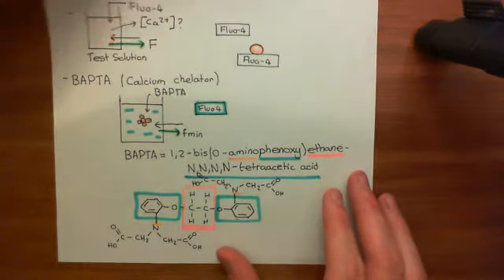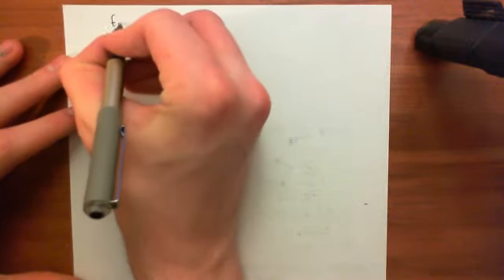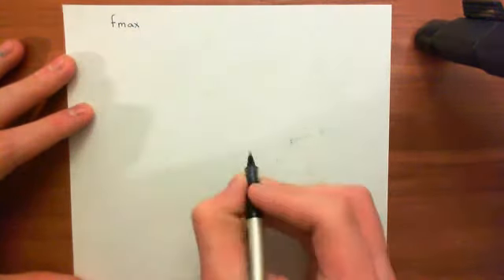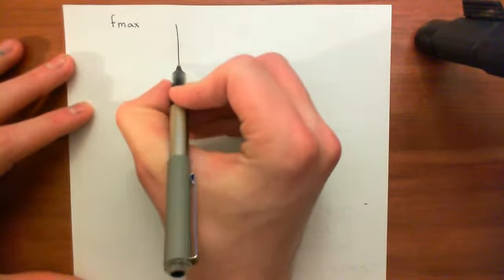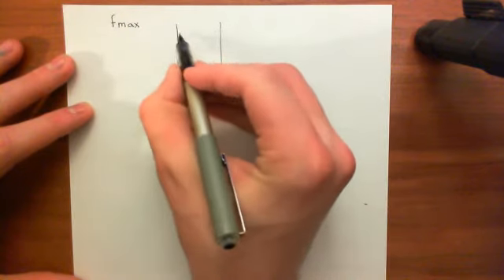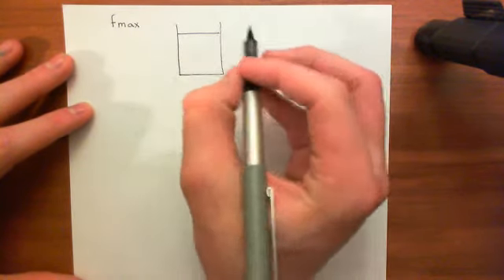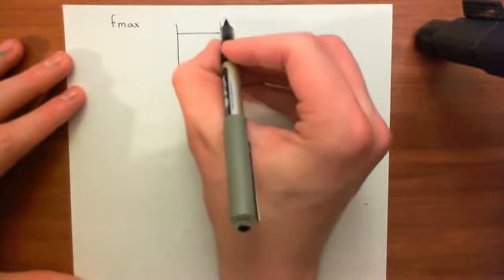Okay, right. Let's now talk about the other final piece of information we need. We also need what's called the Fmax, which is the absolute maximum fluorescence you could get. Now, how would you get the absolute maximum fluorescence that you could get for the number of Fluo-4 molecules that you have within this solution? Okay. Well, you bind calcium to absolutely every single one of them.